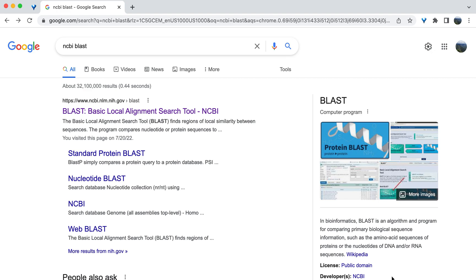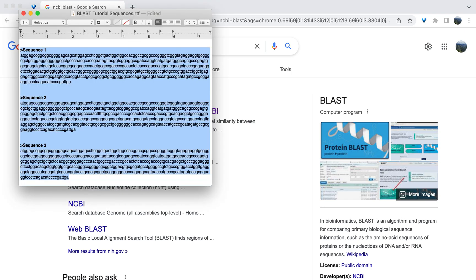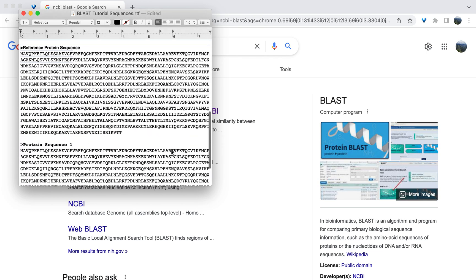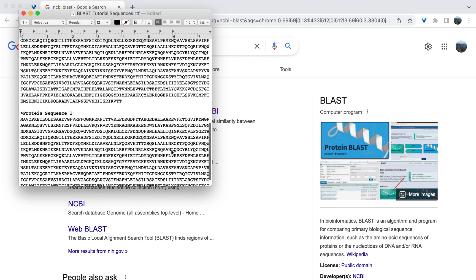Before beginning, it is important to have the protein sequences you want to compare handy. I have mine in a text file here.